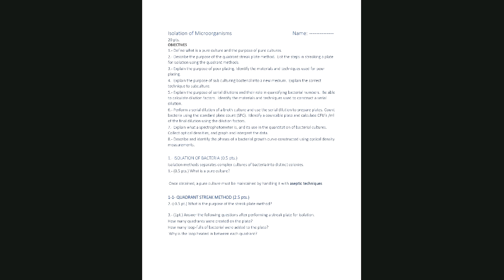If you're lucky, you could isolate, but that's not necessarily a given, because in the pour plate you are going to have colonies inside the agar that you cannot get a hold of. So if the colony you want is inside the agar, then you cannot get it. Okay, thank you. So it's just counting.